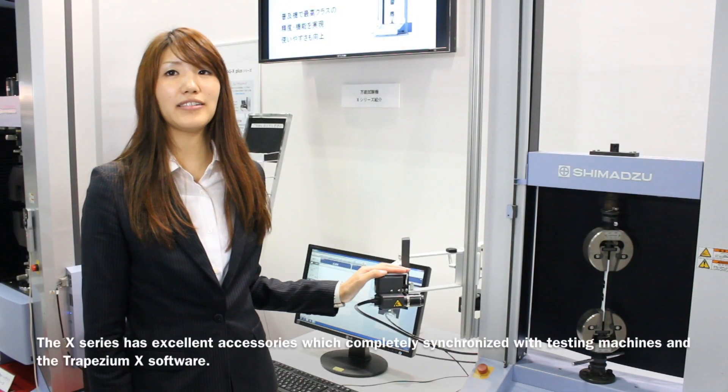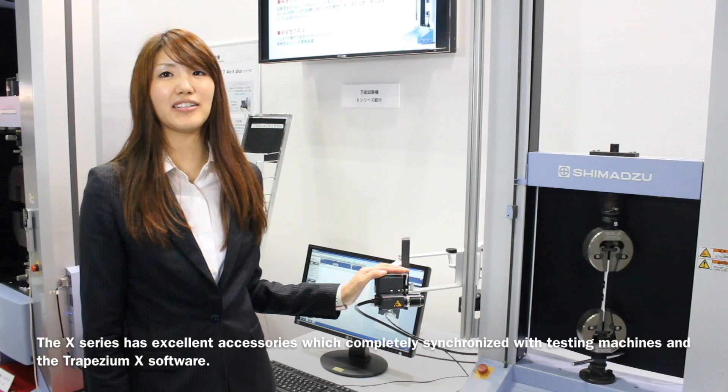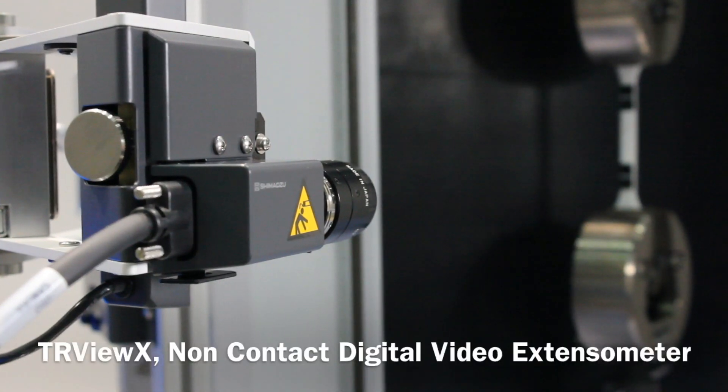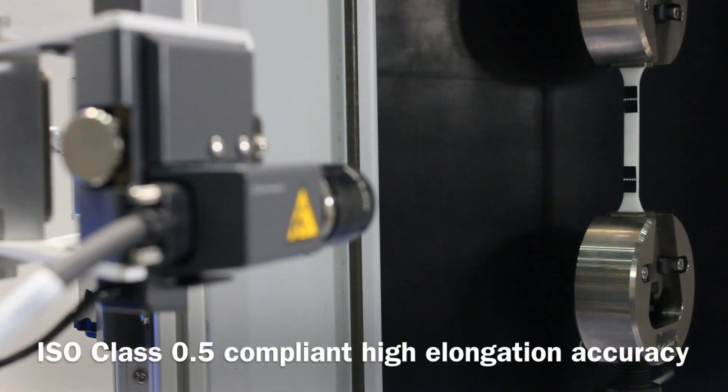In addition, the X series has excellent accessories which are completely synchronized with the testing machines and the Trapezium X software. The TRViewX is a non-contact digital video extensometer which achieves ISO class 0.5 compliant high elongation accuracy.